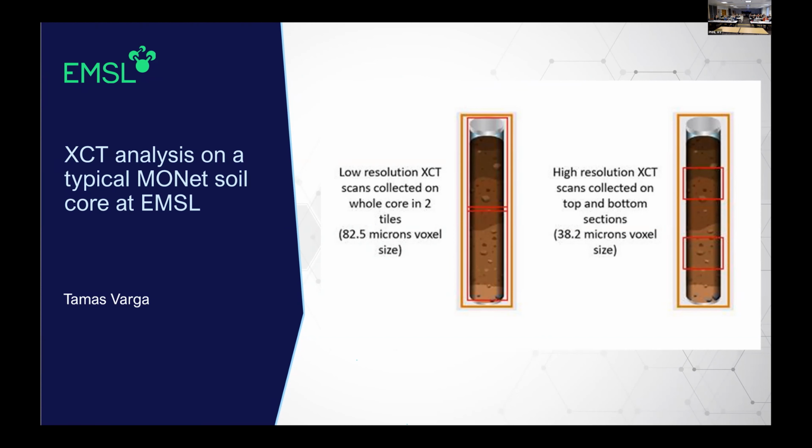So the Geoderma paper was on aggregates which were exposed to freeze-thaw cycles, but they were left to thaw at room temperature for the imaging. That was what was available or possible for that study. But for imaging in a frozen state, you really need to make sure that the temperature is kept constant, because especially in micro CT, it's very sensitive to small changes in the sample, causing blur.